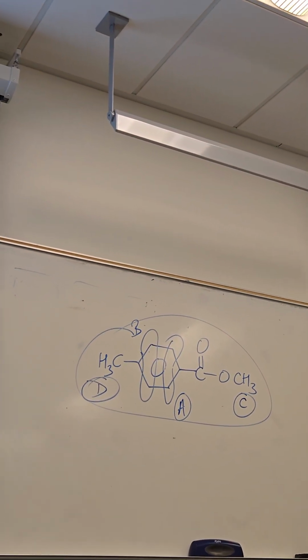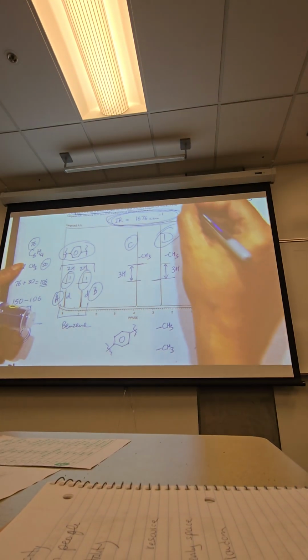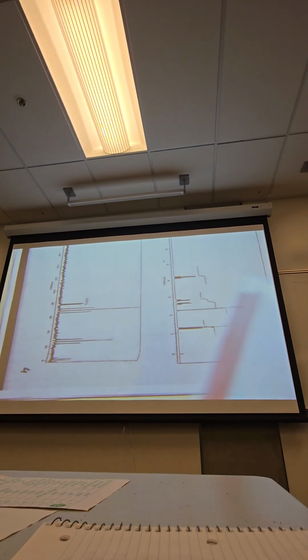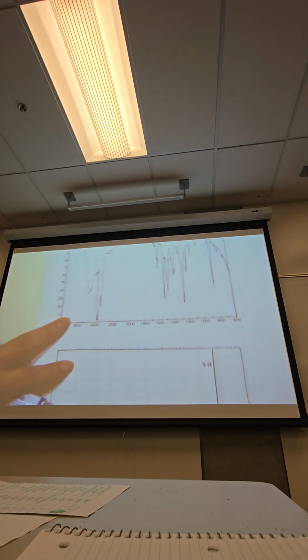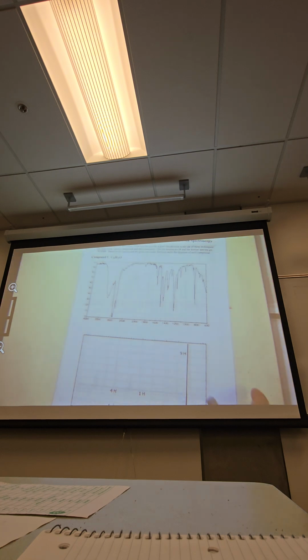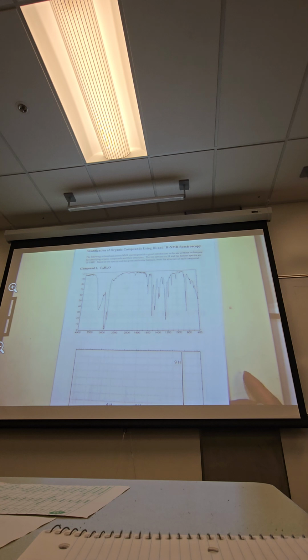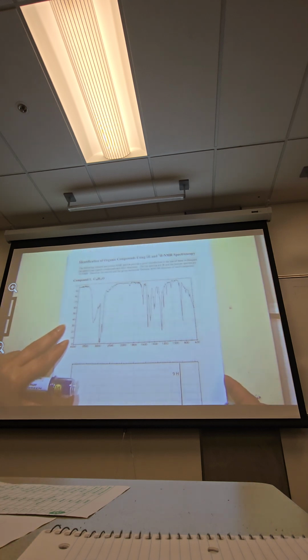The spectrum says it too. So the important part I wanted to mention here: if you ever came across something that said that, please remember, this is the molar mass of the compound. There are a bunch of others, but I want to skip to this. We have literally less than 5 minutes. So we learned IR, we learned proton NMR, so we should be able to put them together. That's the whole point. These tools don't work in isolation. You gather clues from all possible sources.